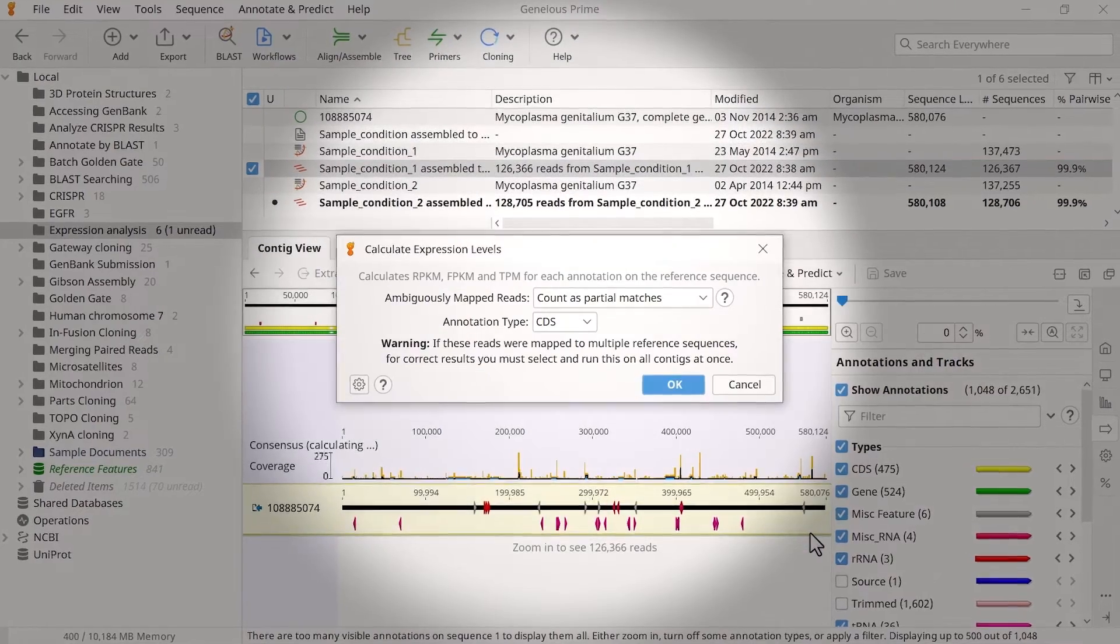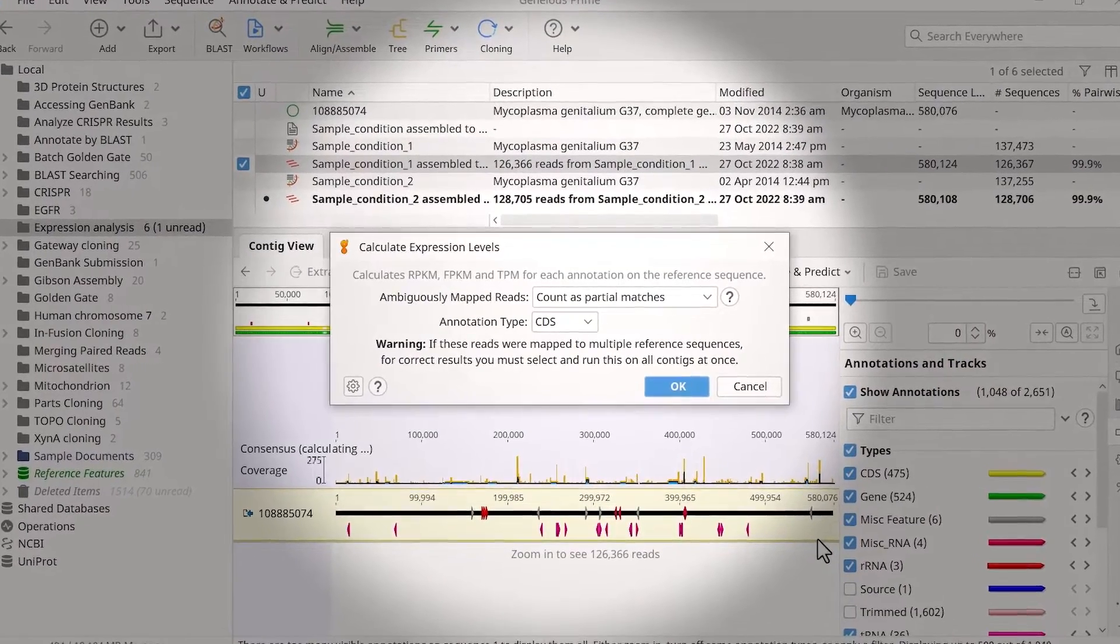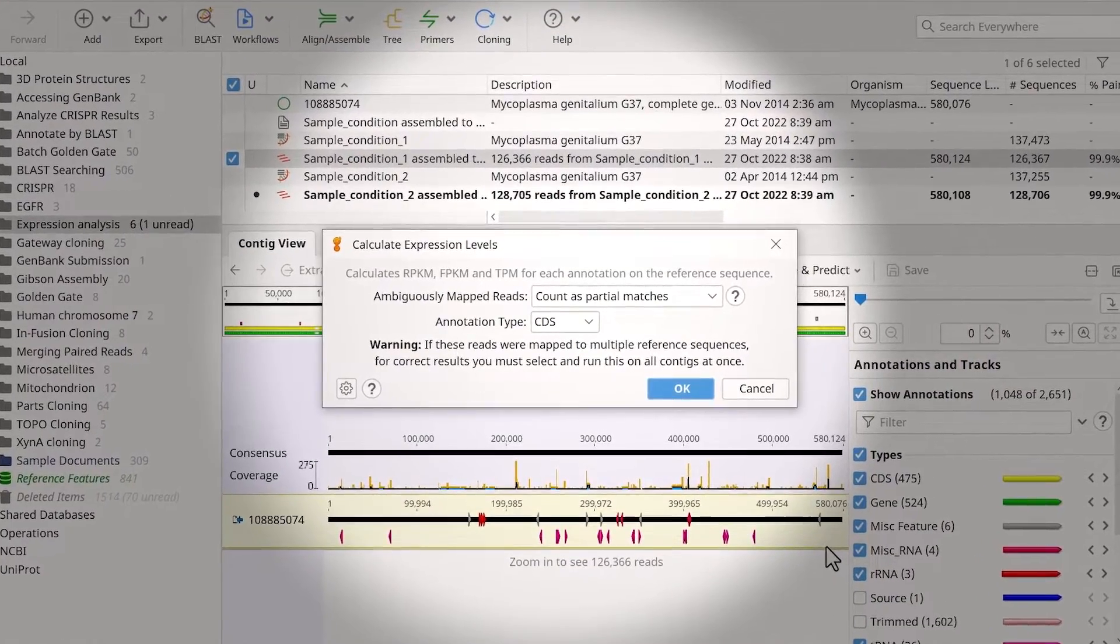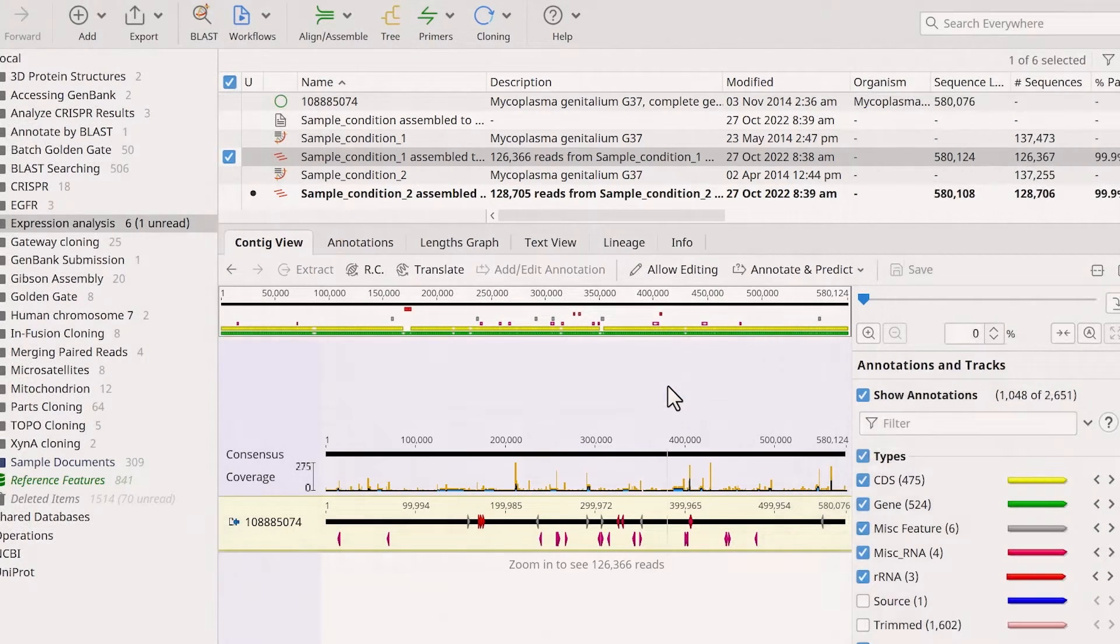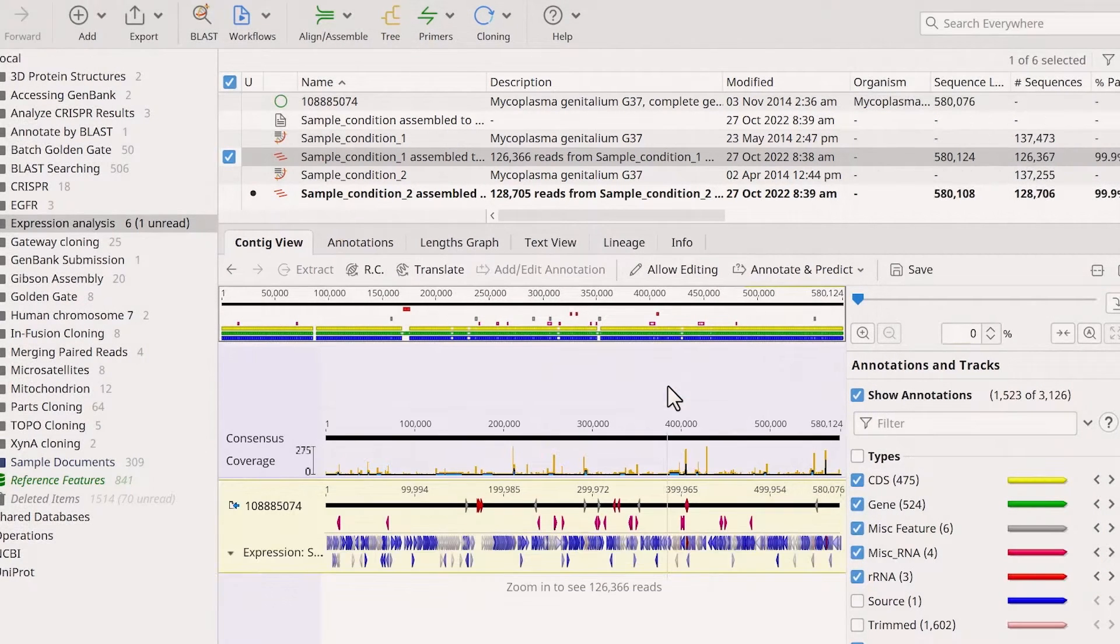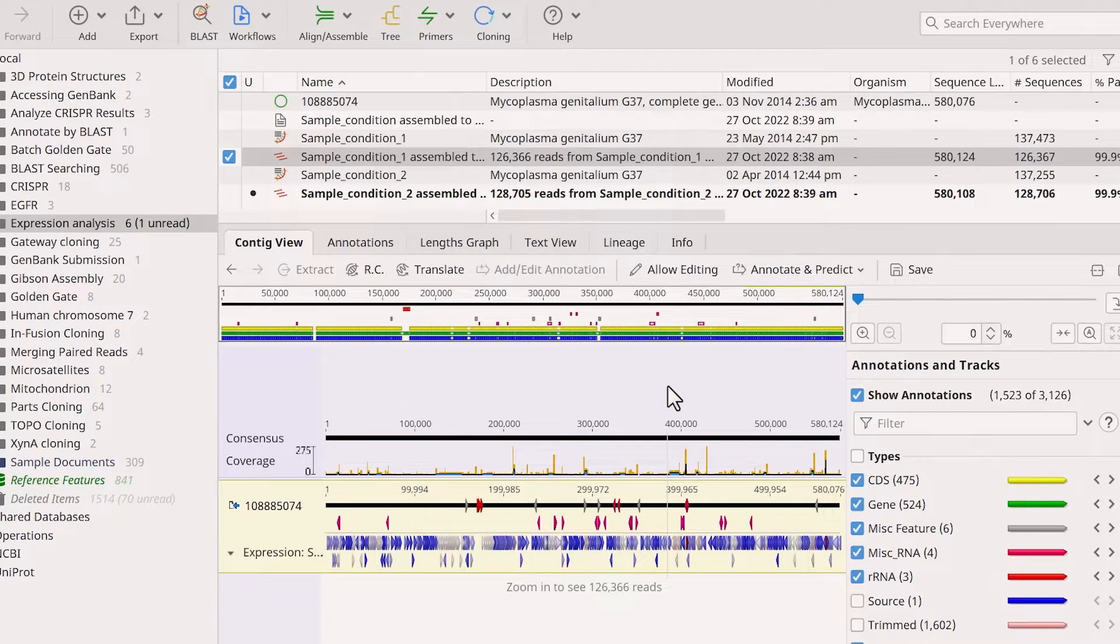In the new window, specify how to treat ambiguously mapped reads and the annotation type of interest and click OK. You should now see a new track created on the reference in the assembly file.